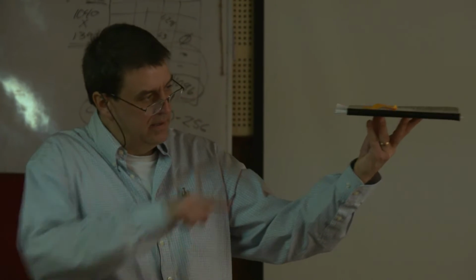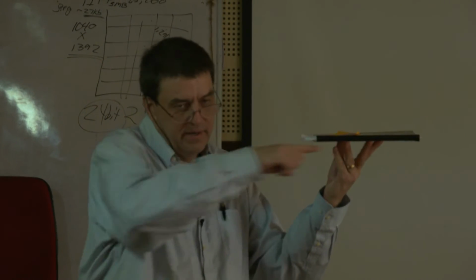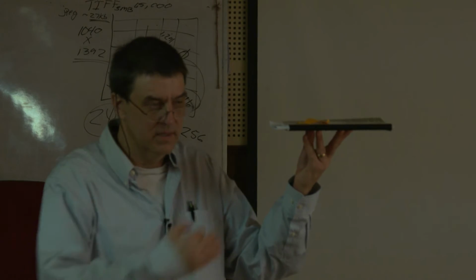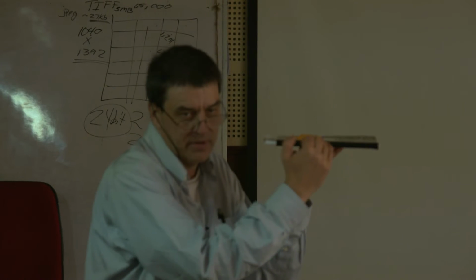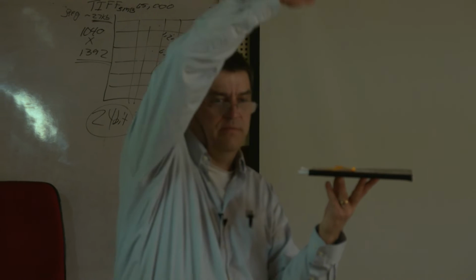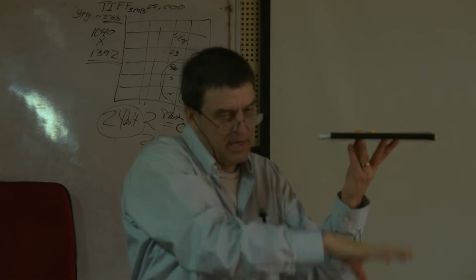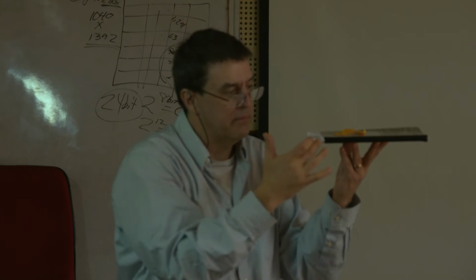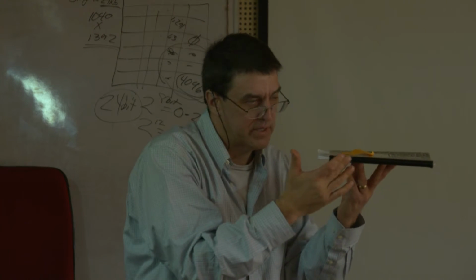Let's say that this line right here is what's in focus on my specimen. So we're looking at it in Z, and this is what's in focus. On a wide field microscope, light from above it and light from below it is all going to go to the camera. Most of the light is going to come from here that's in focus.